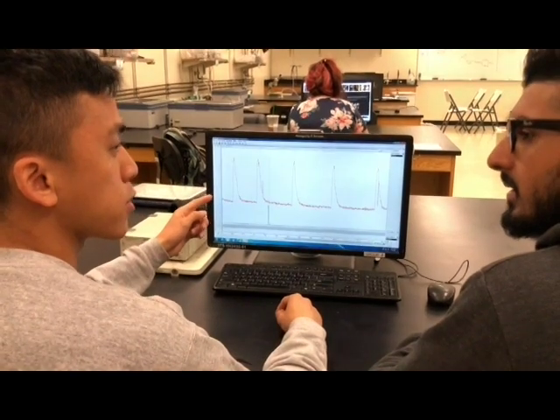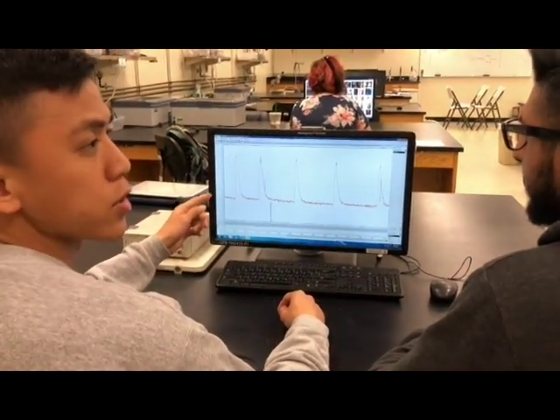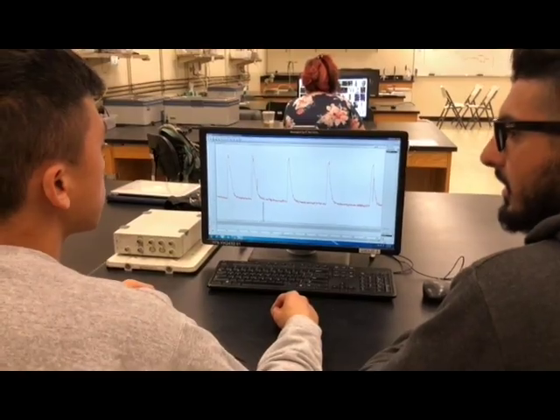The addition of ergotamine has only caused a slight decrease in the frequency and amplitude of contractions. What do you suggest we do, doctor? You're right. I'll go find something else that can decrease contractions a little more. As you can see, you both were incorrect, but correct at the same time, whatever that means. But time is running out, and we need a solution as soon as possible.